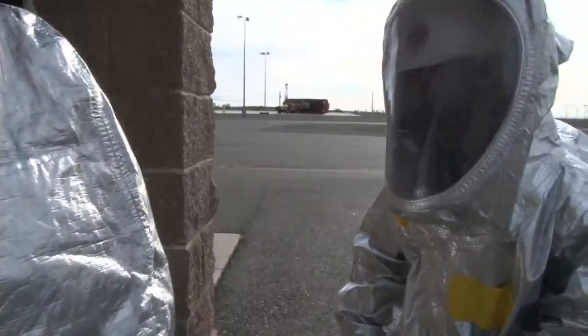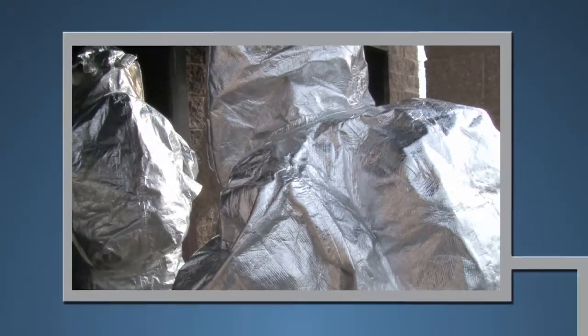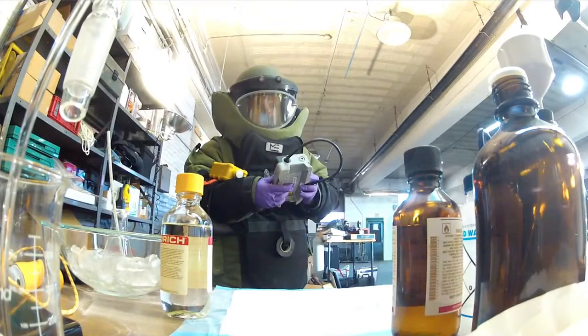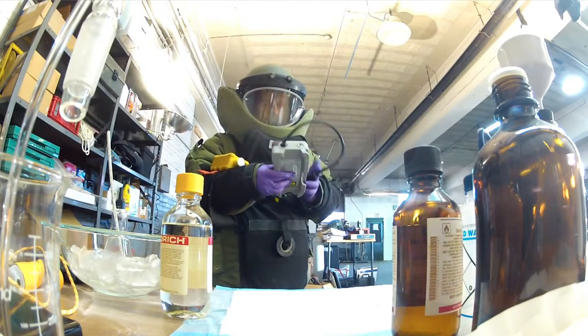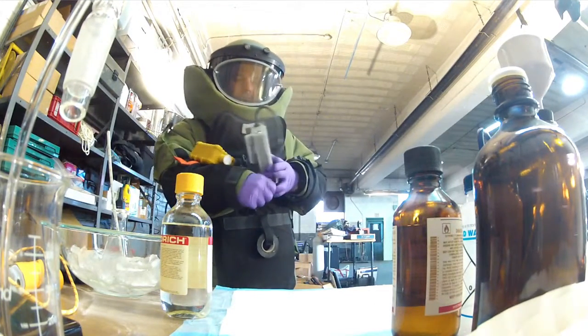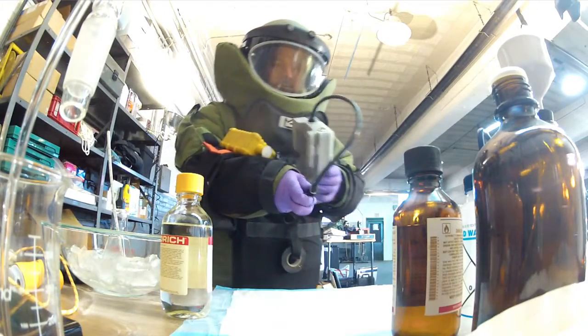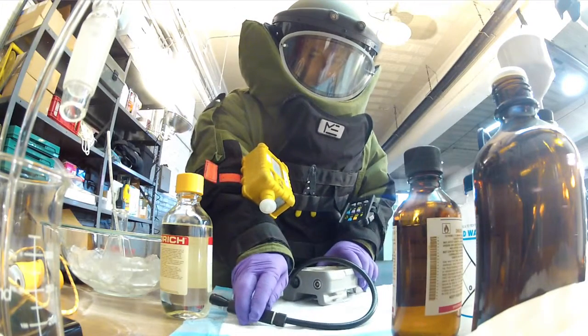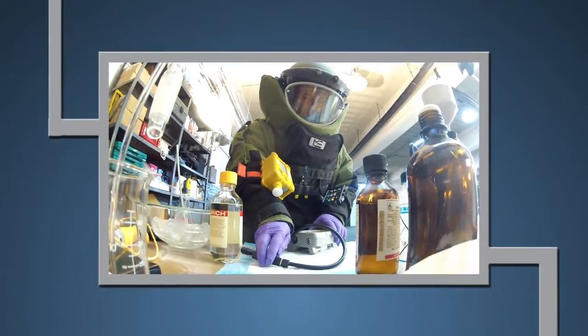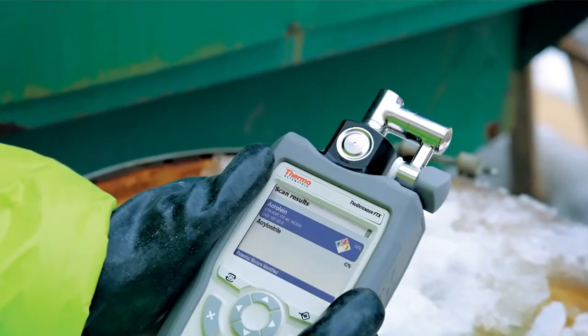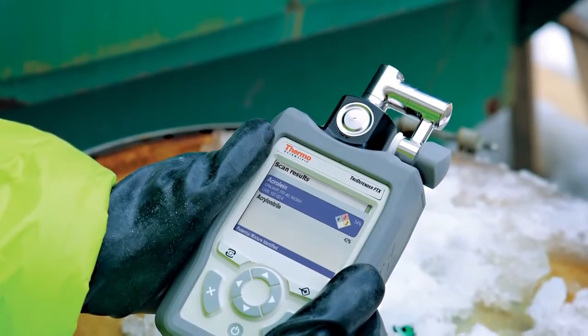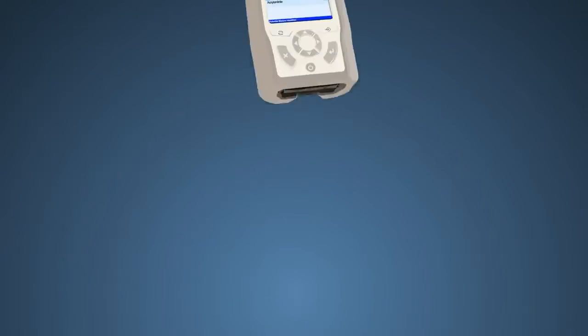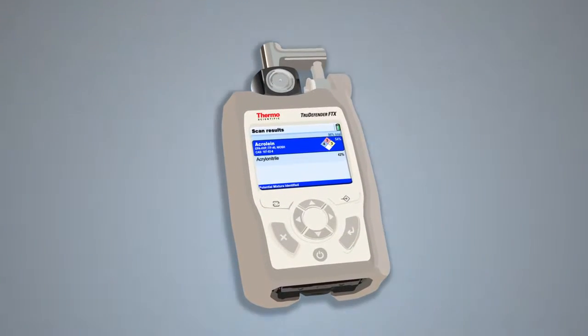Building on our award-winning suite of chemical identification tools, True Defender FTX incorporates extensive user input based on thousands of instruments fielded worldwide. We've applied innovative engineering and the latest thinking in industrial design to create a product tailored to meet the needs of our users.